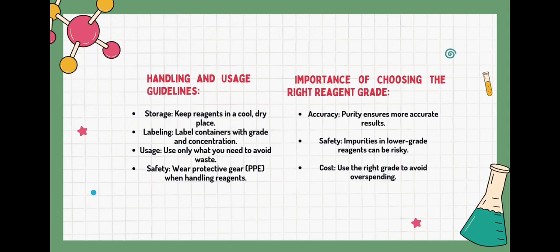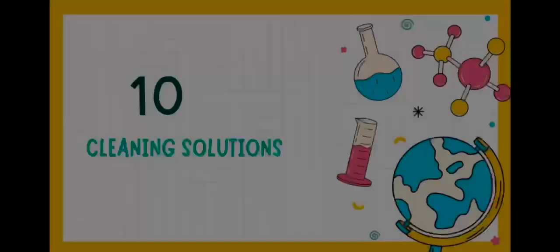Importance of choosing the right reagent grade. Accuracy: purity ensures more accurate results. Safety: impurities in lower grade reagents can be risky. Cost: use the right grade to avoid overspending.